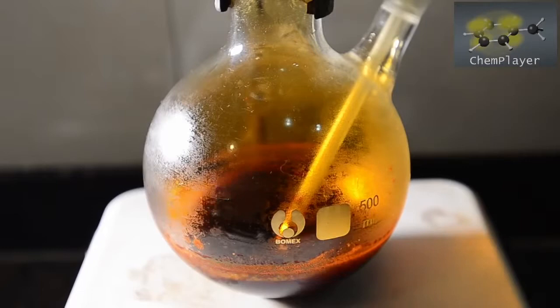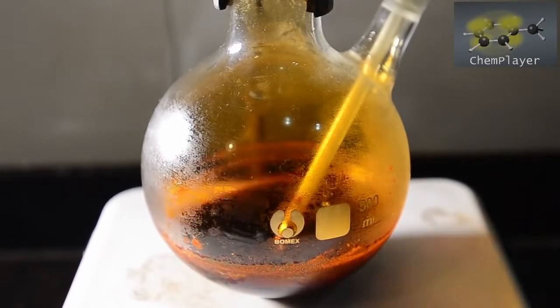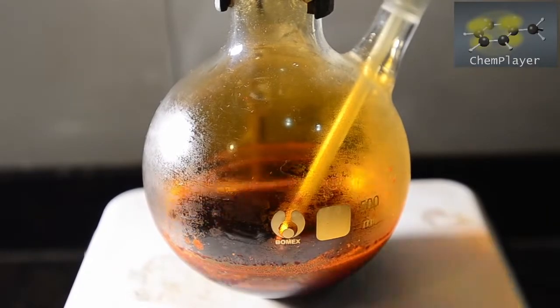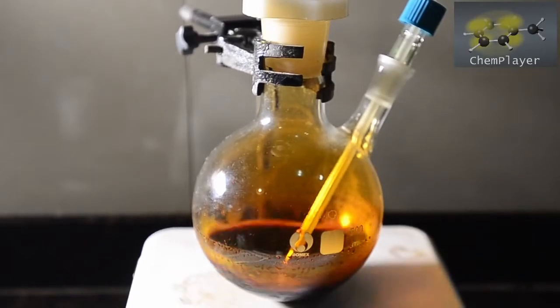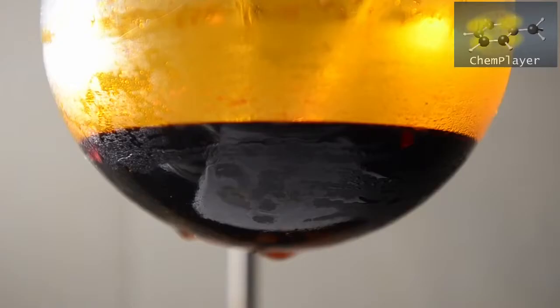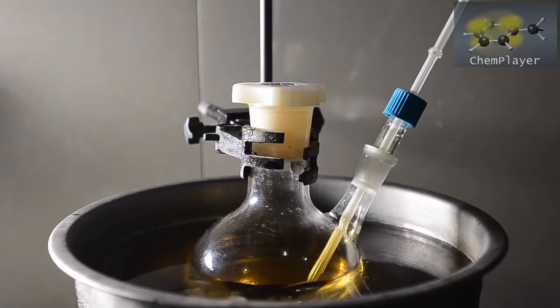We notice that there is still quite a lot of sulfur in solid form suspended in the liquid in the flask, not dissolving and reacting. So we removed the cooling bath temporarily and allowed the mixture to warm up to room temperature. It's a hot day, so that's about 25 degrees. After about 15 minutes we noticed that all the solid had reacted and gone into solution. We now put the flask back into the ice bath again.